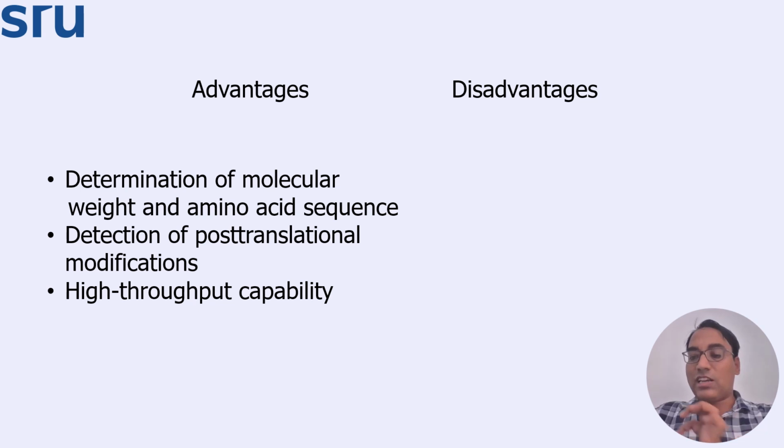Here you can detect the protein function, get its molecular weight and amino acid sequence, all at the same time, very precisely. That's the beauty of this methodology. Moreover, if during cellular post-translational modifications some weight is changed, even by a bit, that is also caught here, because it works very efficiently. So those are the advantages of this method.